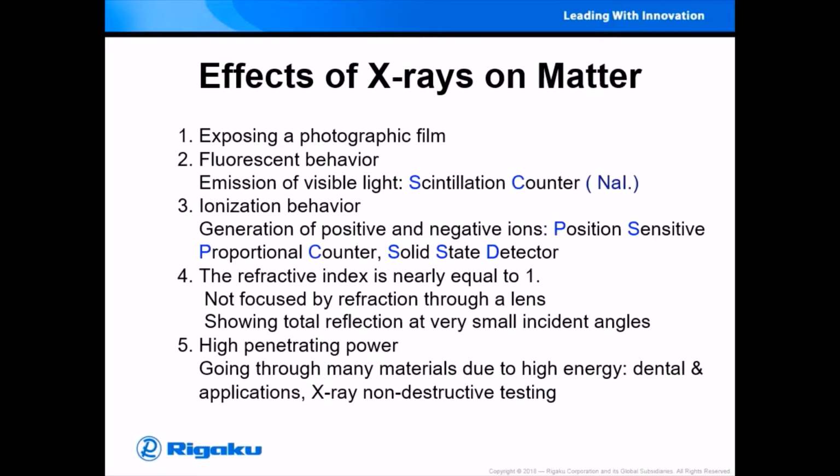Given these properties, they are used for X-ray powder diffractometry and X-ray non-destructive testing, which is contributing to development in scientific fields.